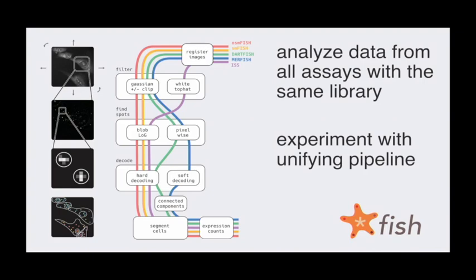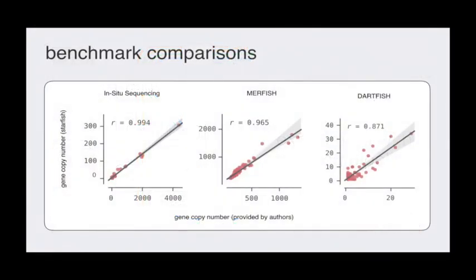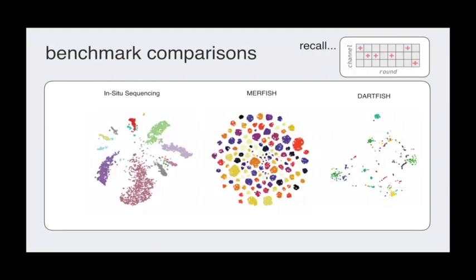So in this tube map, you're free to go off and take your own journey through how to process these data. But since we've been able to standardize on the inputs and the intermediate file outputs, we can really experiment with sensitivity analyses. What really matters? Is there one way to process these data? Or is it truly that there's n ways to do it? So it's an open question. Preliminary evidence suggests that there's less than n ways to do it, but not 1. Which maybe had to come out that way. So does it work? Yeah, don't worry about it. It works. Here's some plots. I can get into that, but I won't.